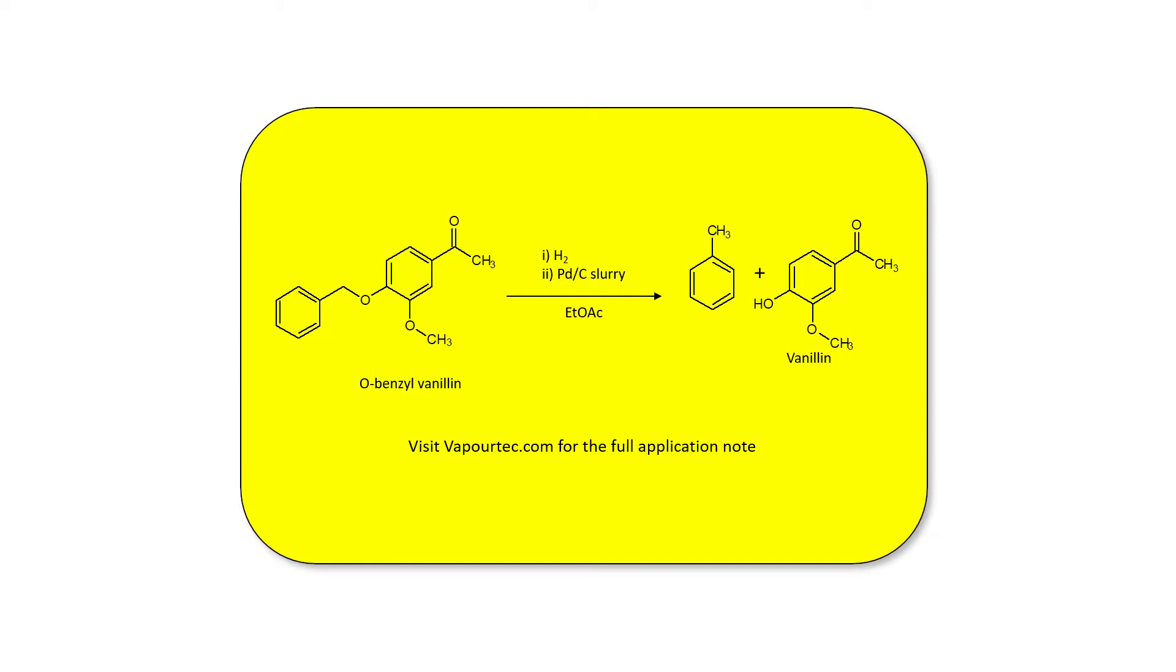Hello and welcome to VaporTech. My name is Ryan Skilton and today I'm doing a continuous flow hydrogenation using a palladium on charcoal slurry and hydrogen gas.